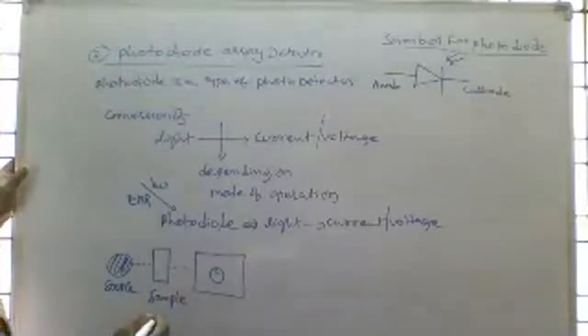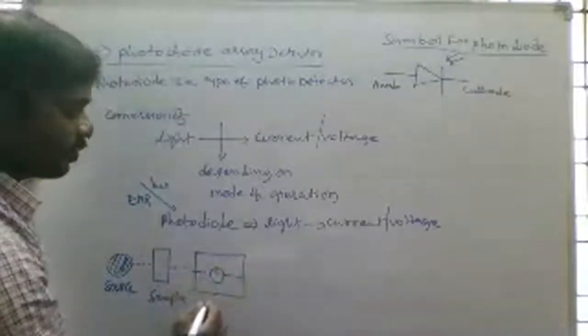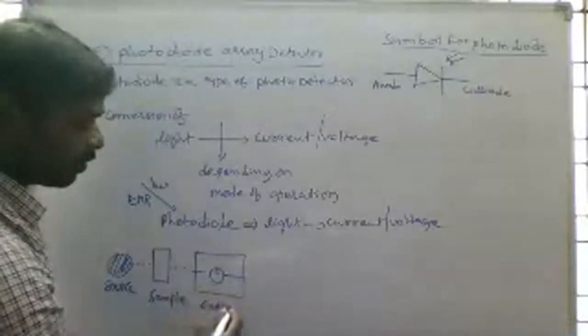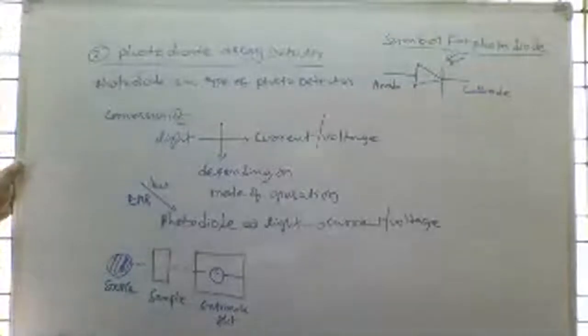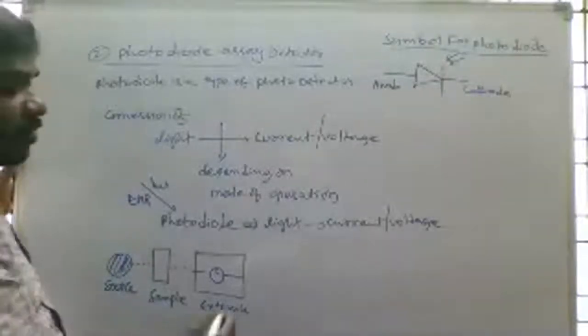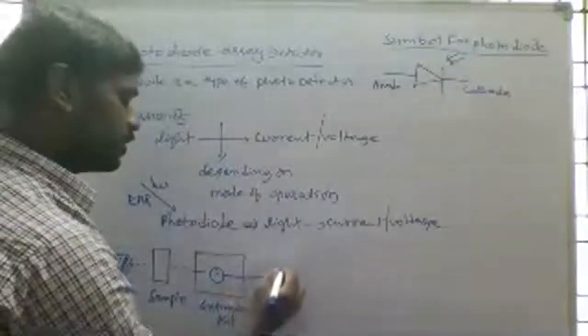The entrance slit is attached to the prism.